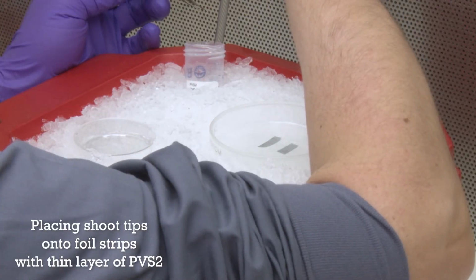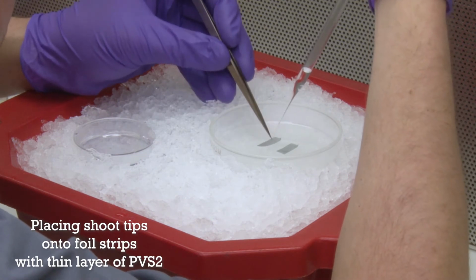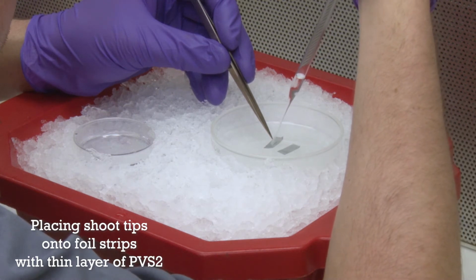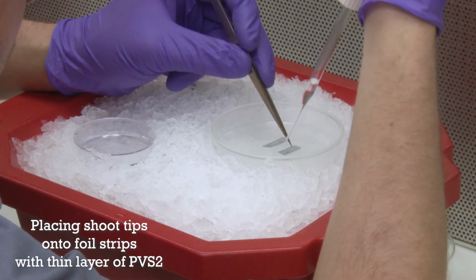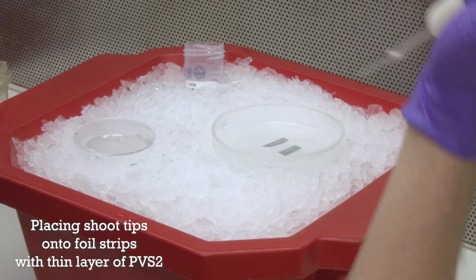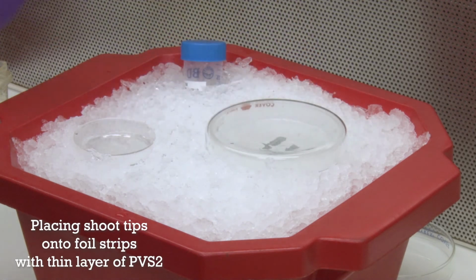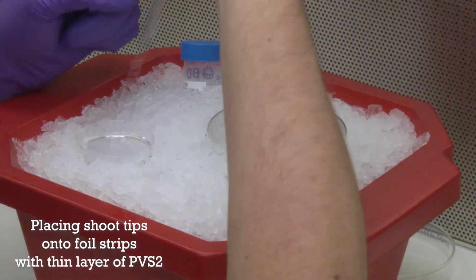And now we are going to take a small amount of PVS2 and form either small droplets or one long droplet. Sometimes it's easier to make one long droplet instead of trying to make several smaller droplets. In the end, it doesn't really matter too much as long as there's a thin layer of PVS2 that the shoot tips are sitting in so that they will be adhered to the foil strip once they are frozen.